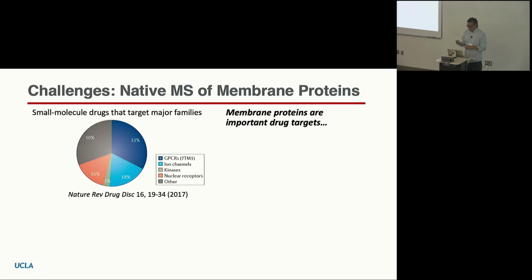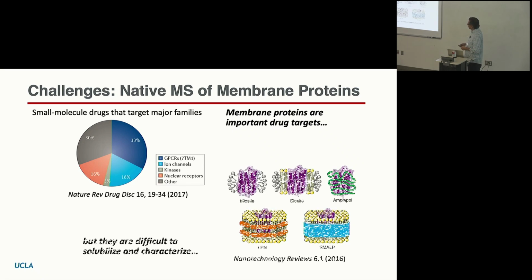All right, so there is one challenge, or many challenges, but one of the challenges with respect to different types of protein complexes is membrane proteins. Membrane proteins are tricky. They're not soluble in water. They're very hydrophobic, but drug companies want to study them because they represent important drug targets that really have been unexplored by pharmaceutical companies. With a membrane protein, you need to somehow solubilize it enough for mass spectrometry analysis. And with membrane proteins, you have limited options, I would say. You have detergents to make a micelle. You have these other vehicles like nanodiscs and these other ones that are shown here that you can solubilize these proteins in. They're going to be water soluble at that point.